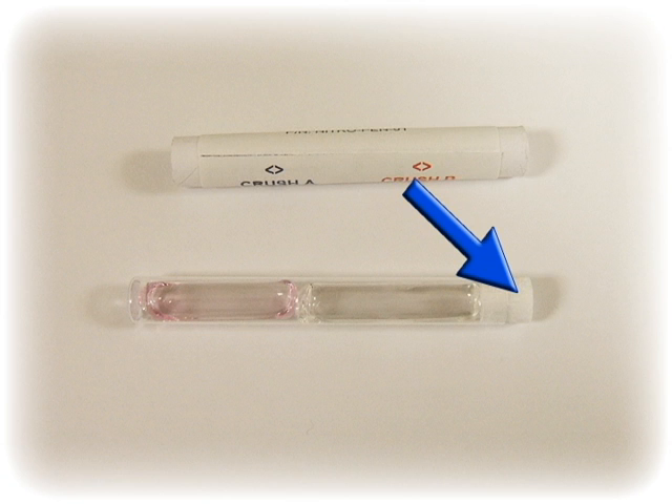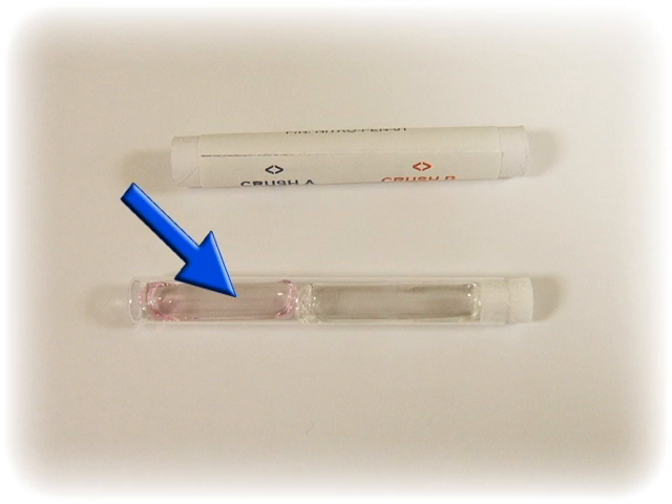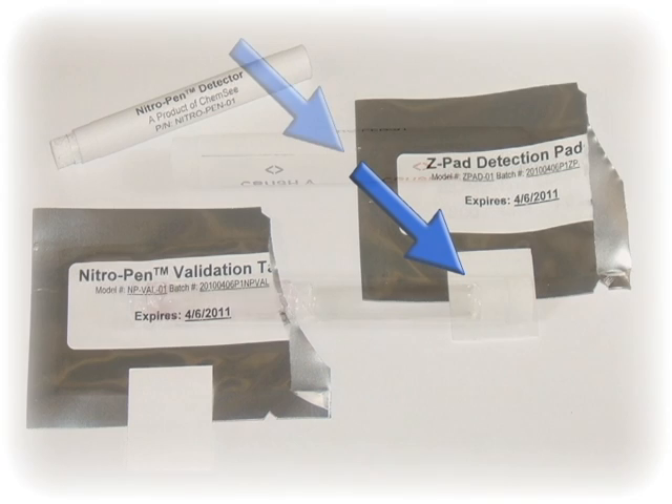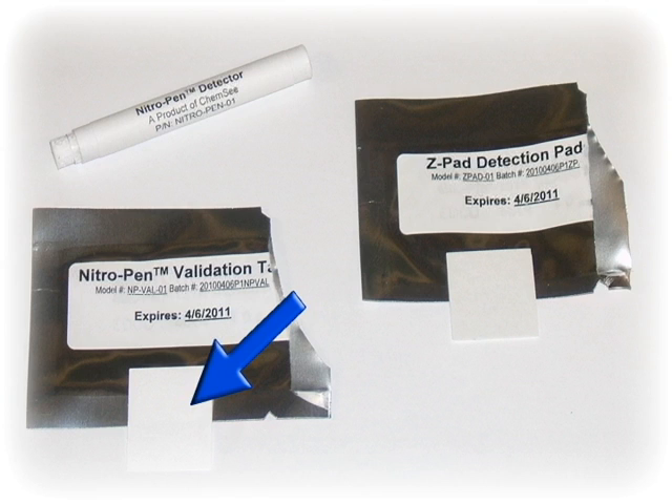Moving down the detector is ampule 1. This ampule contains a reagent which will detect aromatic nitrates. Further down the detector is ampule 2, which will be used for all other materials. The nitro pen is enclosed in a detector tube to protect the swabbing detector as well as provide protection when breaking the ampules. The Z-pad upgradeable option is used for detection of inorganic nitrates, and the validation pad upgrade is used for verification of proper use.